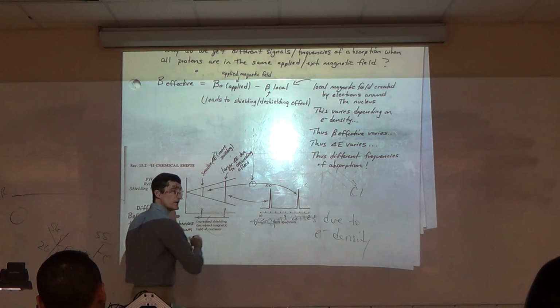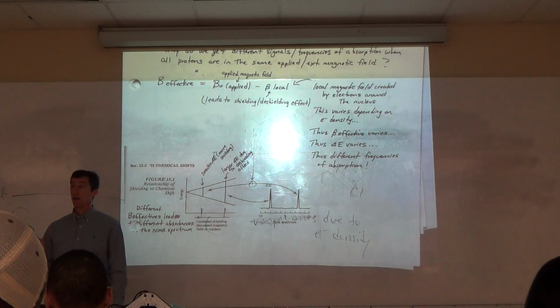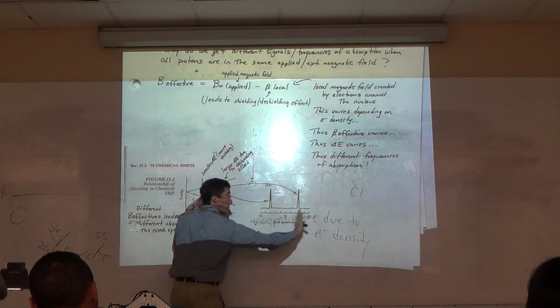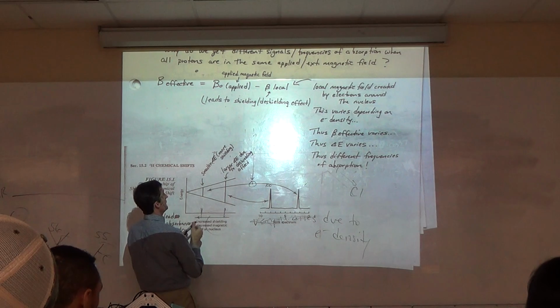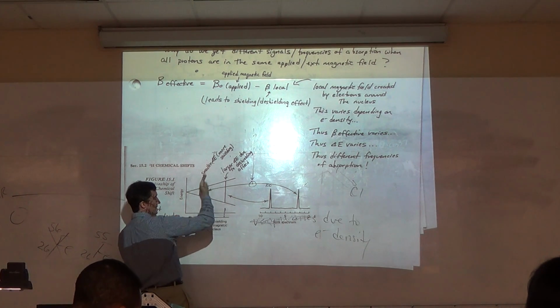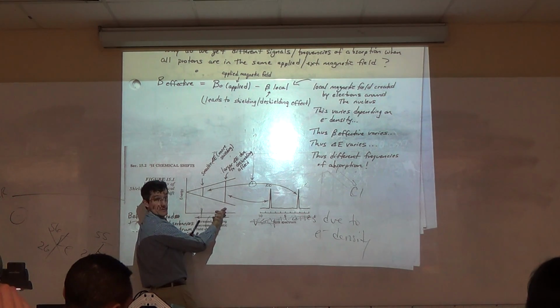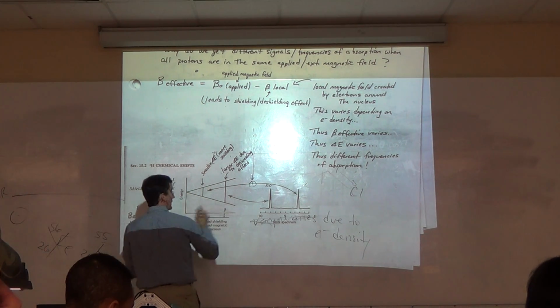Now, the NMR is shielded more to the right or left? You have to look back at that terminology. Yes, to the right. This gives a signal more to the right. Okay? This is my shielding effect, or this is a consequence of shielding. This is not as much shielding, so we call it de-shielded. And the de-shielded signal is more to the left. That would go with that one.